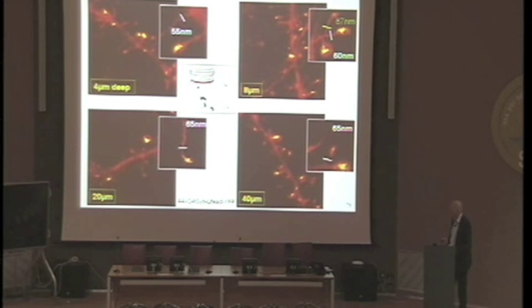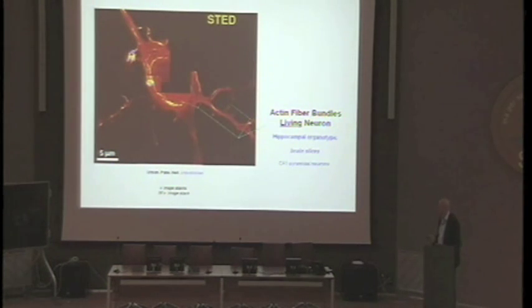But it's important that we can access now the spines in the living mammal. One can imagine now doing experiments like giving visual cues to the mouse, and then seeing what's going on. You can optically deprive the eye or something, and see how maybe the spines are formed and so on. So this is work which will come for sure. So this is an interesting area.